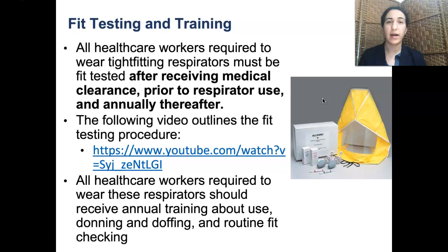All healthcare workers required to wear tight-fitting respirators must be fit tested after receiving medical clearance, prior to respirator use, and annually thereafter. The video posted here outlines the fit testing procedure. All healthcare workers required to wear these respirators should receive annual training about why and how the respirators are used, and how to conduct fit checking every time they use one. This video is important to review when you plan a respiratory protection program to understand the fit process. Proper fitting is important for both N95 respirators and for elastomeric reusable respirators.